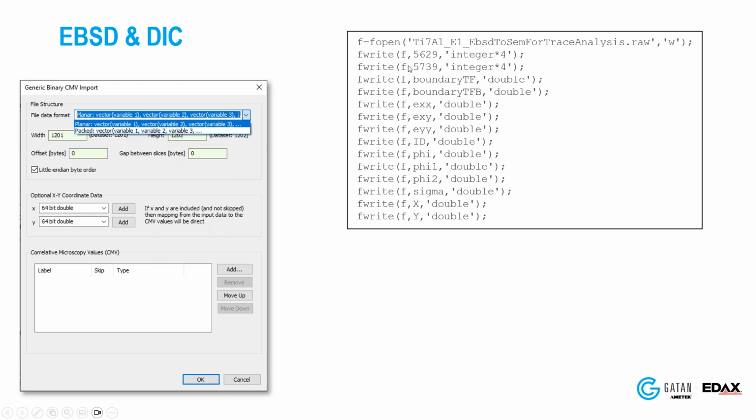And here's the figure on the right, which shows how the data is written to the file. So you can see the first two entries in the binary file are basically the size. And then after that, it's each set of data points. So we have various data points.